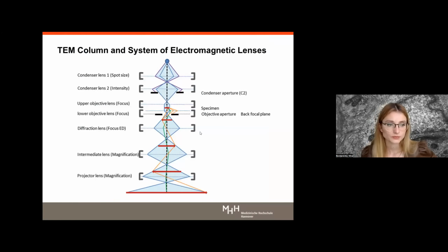So once again, the transmission electron microscope uses a fine electron beam created by voltage and electric current heating a tungsten filament, focused by magnetic lenses, and the electrons pass through the ultrathin plastic section impregnated with different heavy metals like osmium, uranyl acetate, and lead.